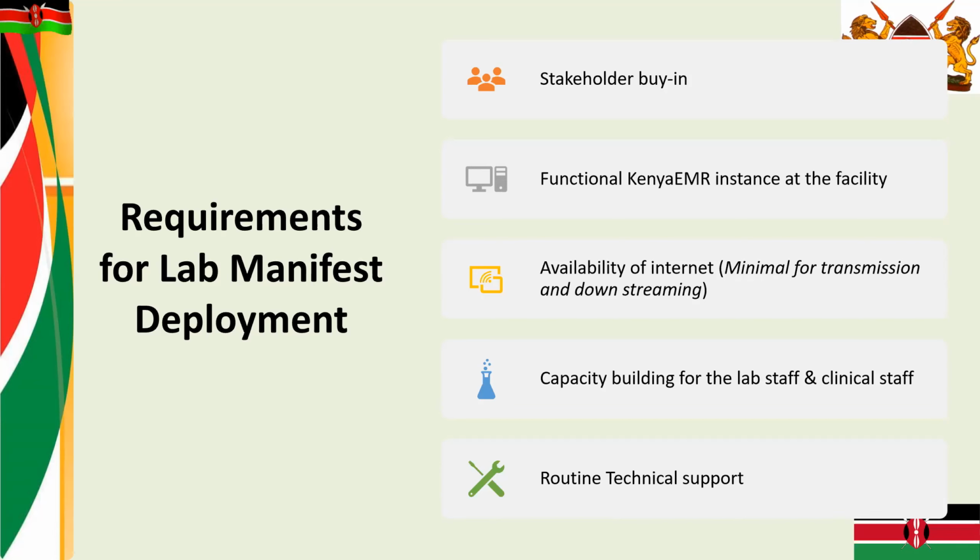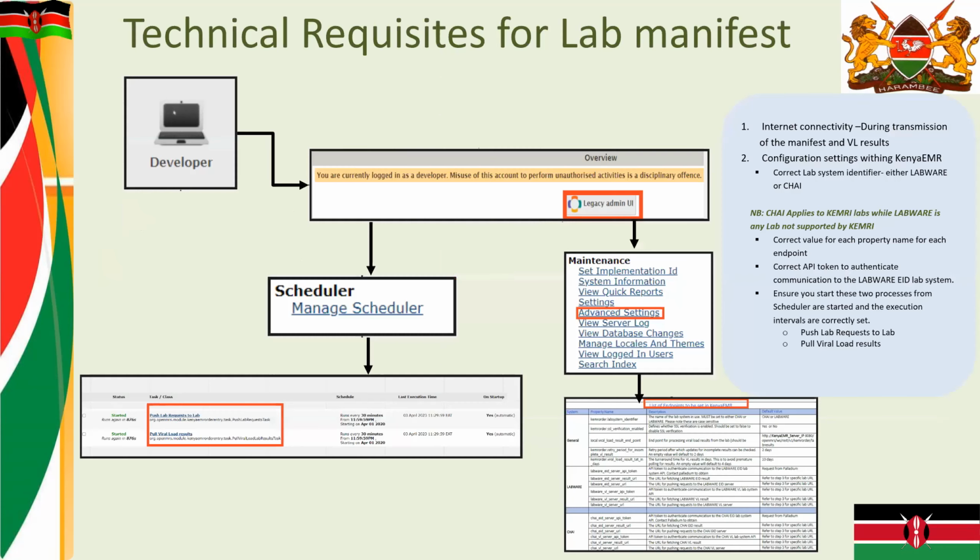So it is really important that when you are implementing this, you build the capacity of the lab personnel as well as the clinical team. And of course, there should be ongoing technical support just in case of anything. That can happen via the partner, or through the Palladium service desk, where you are able to receive ongoing technical support on various issues.